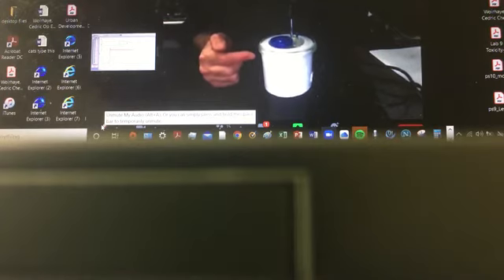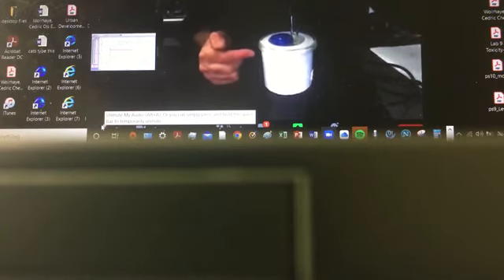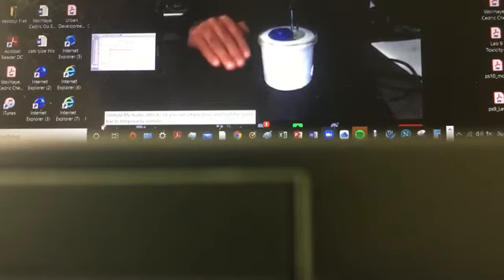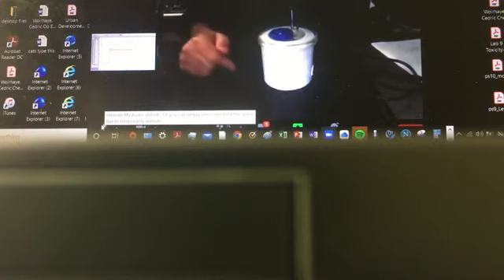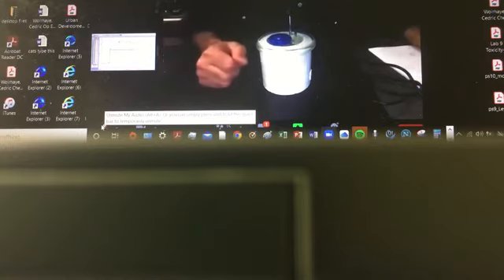cold slowly. So now it's flickering between 26.2 and 26.1. It's going to continue going down, eventually decreasing until the room temperature, whatever that room temperature is. Agree? Because that container is not perfectly insulated. So that feature is going to help analyze the final temperature. The final temperature, we already missed it.